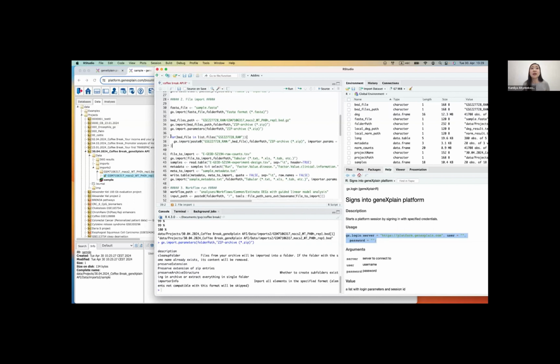you see that I'm actually doing it now in a loop. So I extended the import command a little bit and also put it into a loop to upload all the files that I have under my folder.